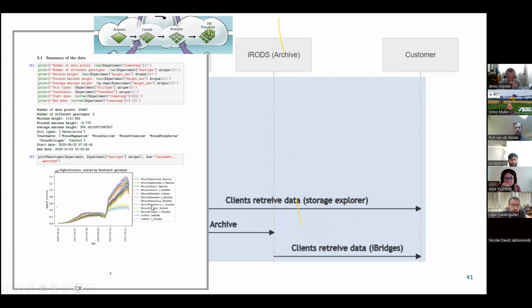So they can change these graphs easily. They can mess around with whatever they want because they always want to have something specific. The Python notebook is easy to use and very interactively shared. It's basically a text. Even in Google Colab, for instance, you can run this Python notebook. If you have the CSV file and the images, you can do it on your local PC or on your cloud, or within Google or within Azure.